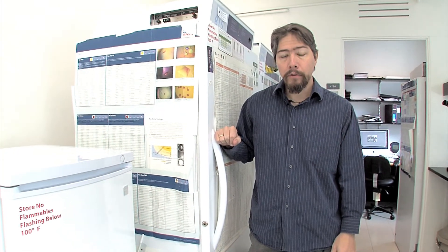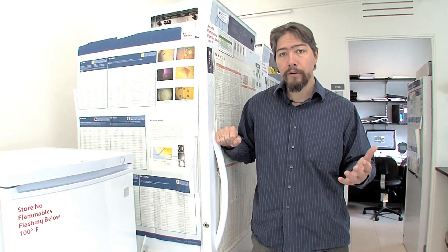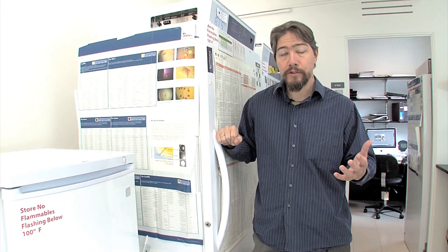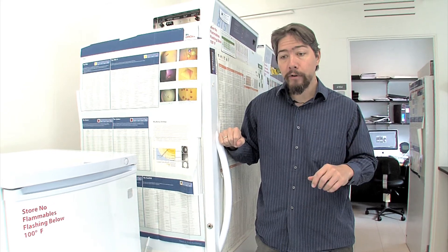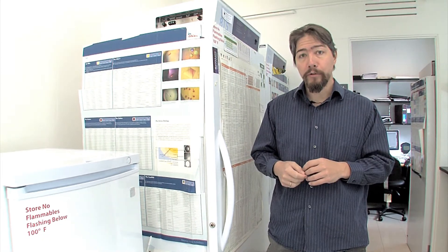So once we have grown large and very nice crystals, then we're ready for the big leagues. That's when we shoot them with X-rays at a generator to start collecting the images we use to reconstruct the molecular model of the protein.